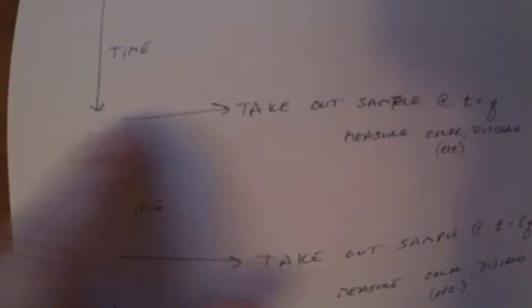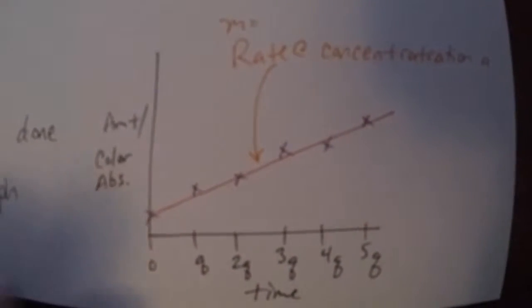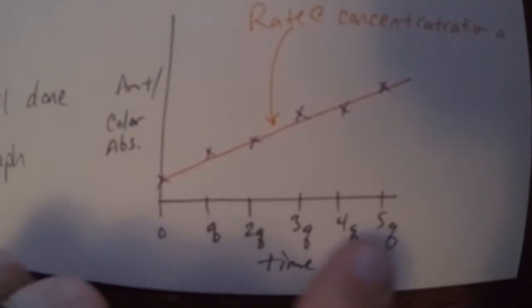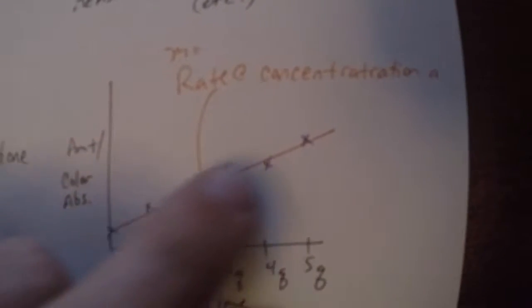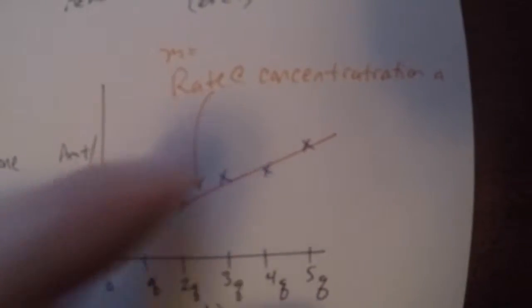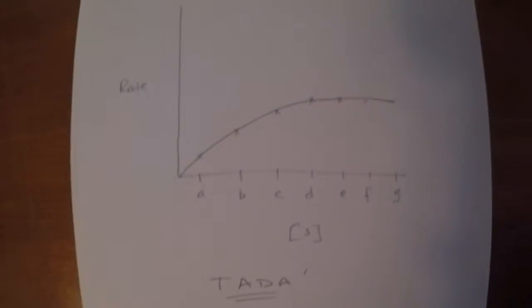As soon as you pull the liquid out, you run the test. While it sits, oh, it's been another minute. Pull another volume of liquid out, run the test. Oh, it's been another minute. Pull another volume out, run the test. And what you'll eventually do is hand create this graph, because you are choosing the times and whatever you're measuring, whatever that turns out to be. Get a line of best fit, slope equals the rate, do this for every single concentration, and boom, you make that graph.